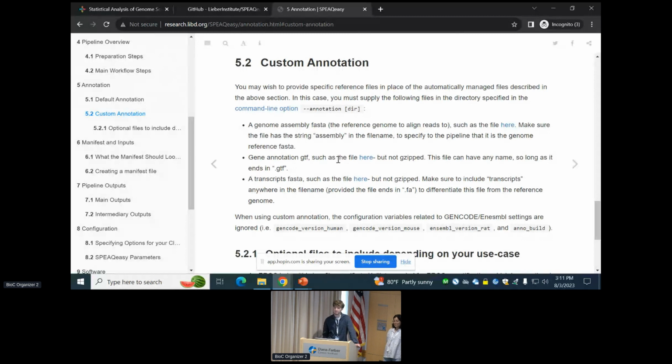So you said you pull everything out into the row ranges, stick it out as the GRanges. So that's good. But what are you using in the other things as your row names for the genes? Is it symbols? Ensembl, to make sure it's unique. Okay, but you are using Ensembl. So it would have been pulled from the standard, which would have been the gene_id attribute in a GTF file. I believe it is, yeah. Okay. That's fine, because that's where Cell Ranger broke: NCBI files don't have symbols in the gene_name attribute, it's just the gene attribute.